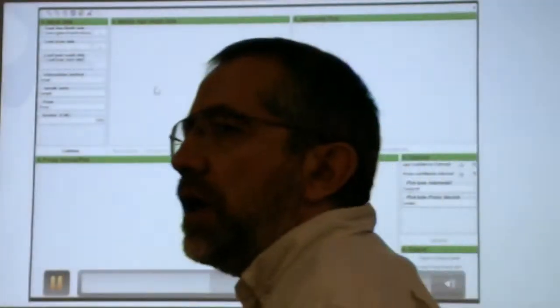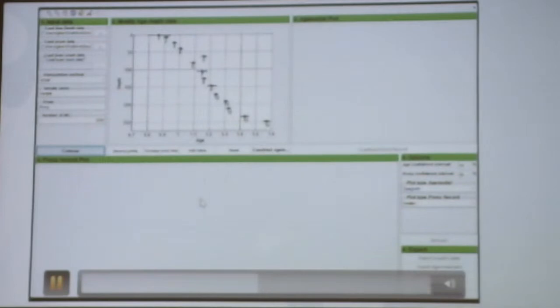It doesn't seem like it's doing anything because when I was doing the screen capture, it's not capturing the other windows that are showing up. But I'm loading here a text file with the data, a text file with the proxy details. Here the main difference is that I'm including the depth of the sample and the value of the proxy.